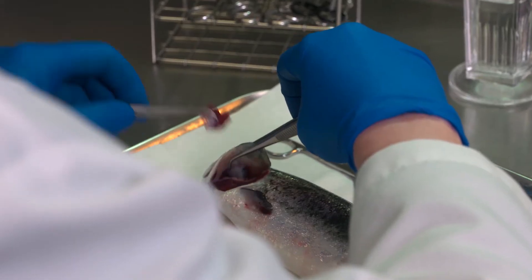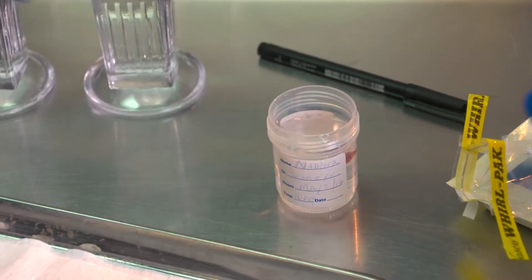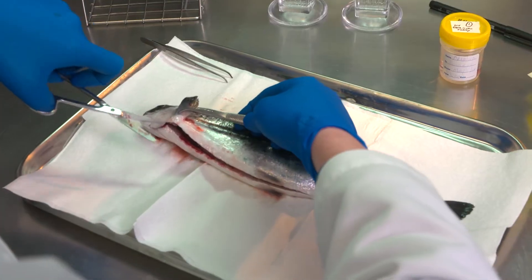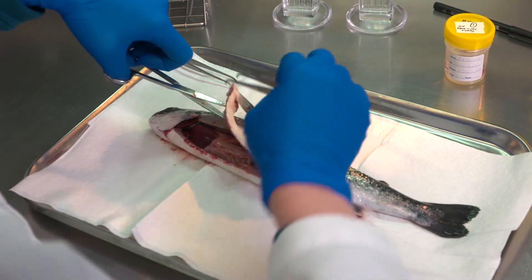First, a gill clip is taken and placed in a bottle of fixative. Then, the abdominal cavity is opened up to gain access to the fish's internal organs.